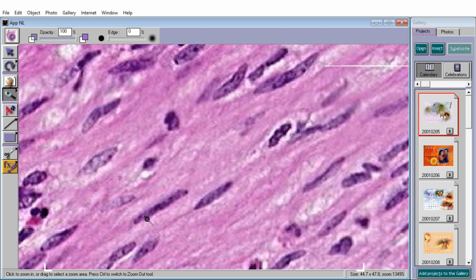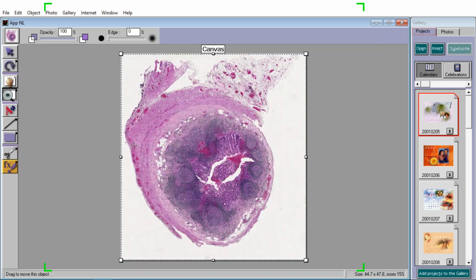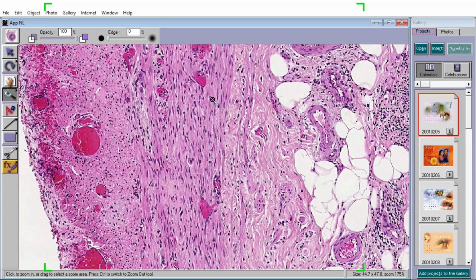Okay, now they look like they're hot dogs because they're cut longitudinally, so you know this is the circular layer. But if you see cells that are cut that look like hot dogs, it could be more of a longitudinal layer. When you cut it in cross section, it looks round. Let's see if we can give you an example of that too. Let's take a thicker area here, like right there. Yeah, these cells here look like they're spindly or longitudinal, or a hot dog that's cut longitudinally.